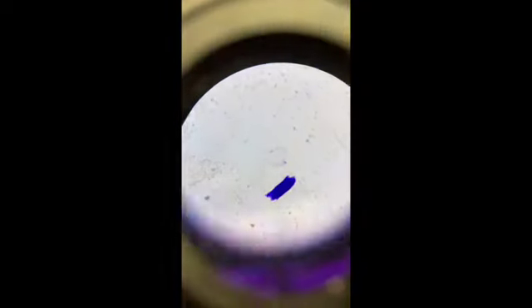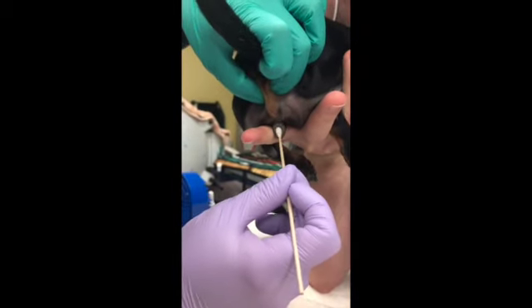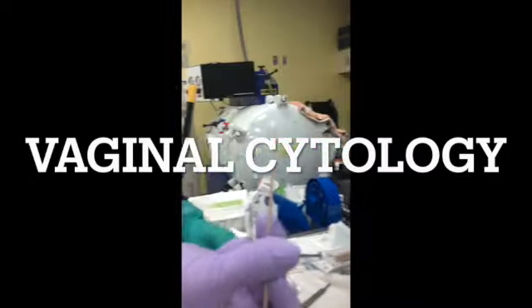There is our skin impression stain slide. There is a squamous cell right in the middle — it's a little bit clearer so it's hard to see — and then the rest is just debris.